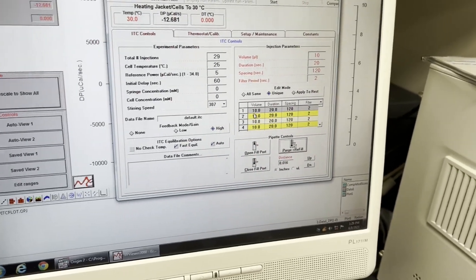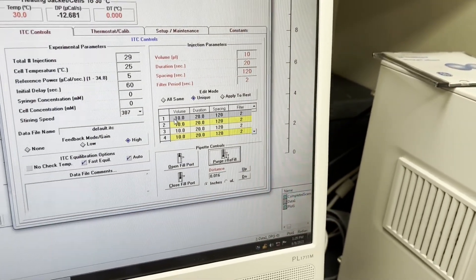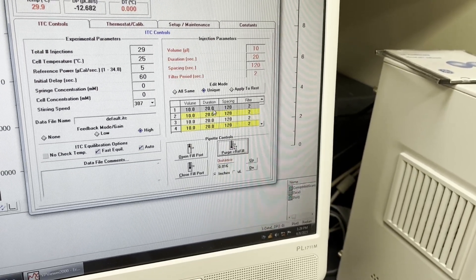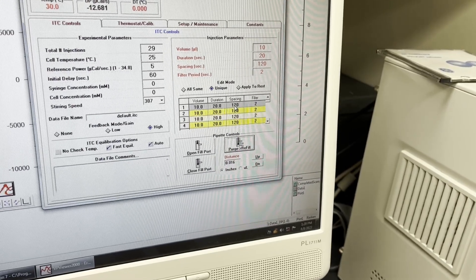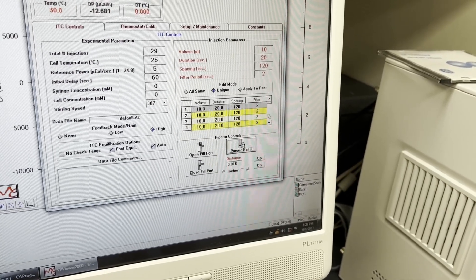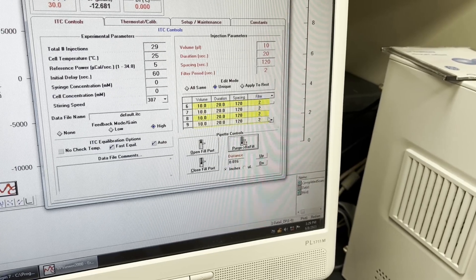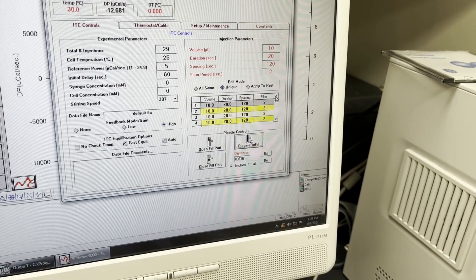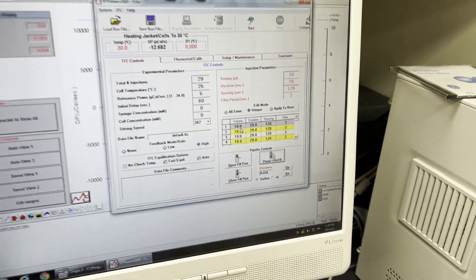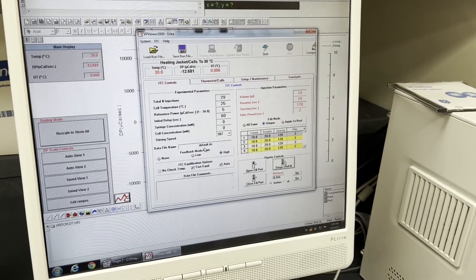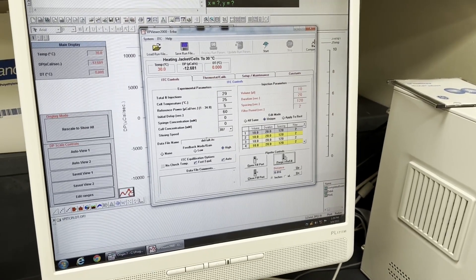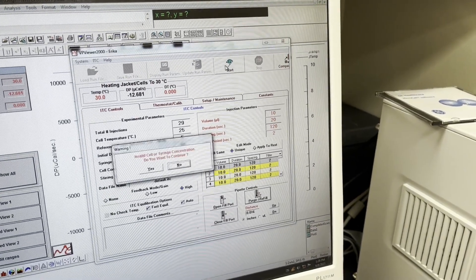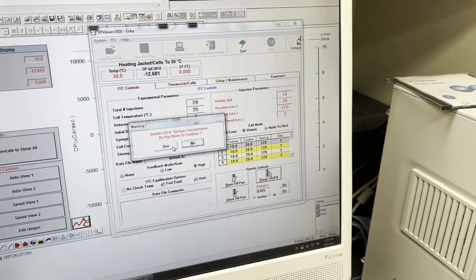You can also adjust how many microliters for each injection it's going to inject, how long those injections are taking, and the time in seconds between injections. These are all pretty standard to start with, but if you would like you can adjust those for your experiment. Once you have all of that set up and you've put in a name other than default, then all you do is go to the start button.